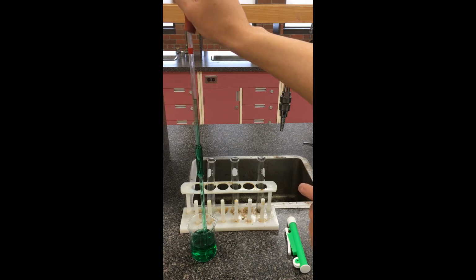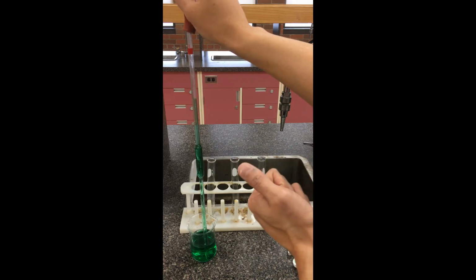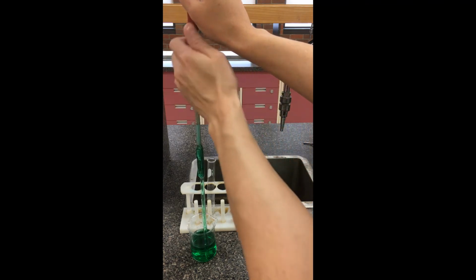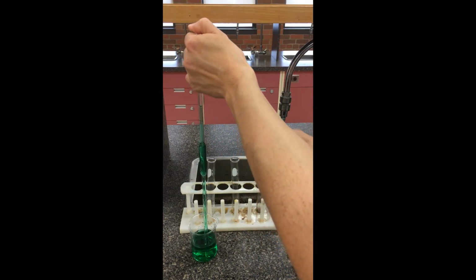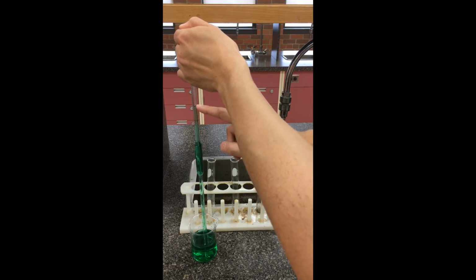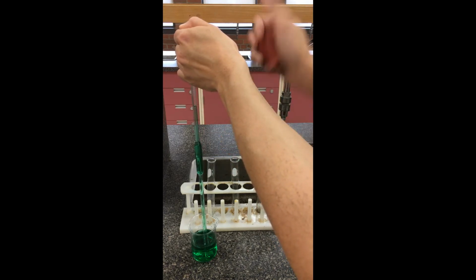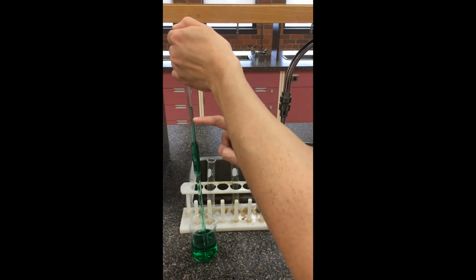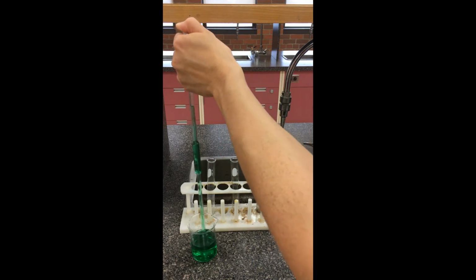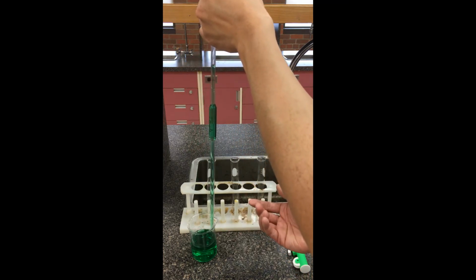As quickly as I can, I'm going to pull off the bulb and, with my other hand, seal it with my finger. As long as your finger is over the top, that forms the air pressure you need to keep the solution up. Obviously, we do want to start wiggling our finger so that this line will fall down to that 10.00 calibrated mark. You can hold it out of the solution at this point.